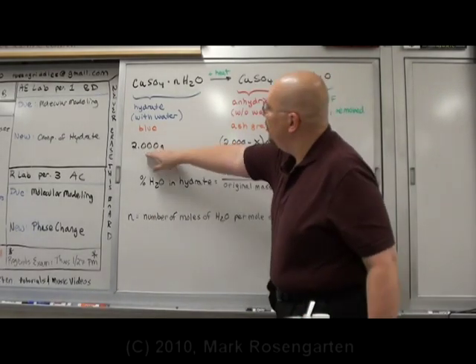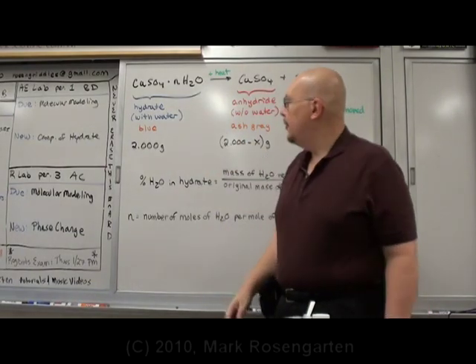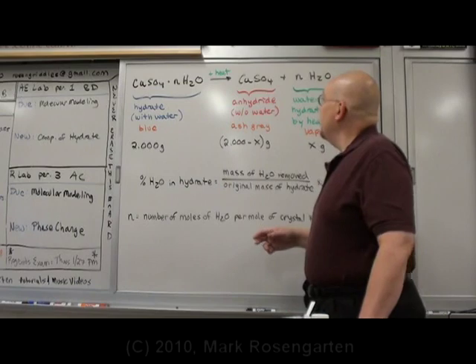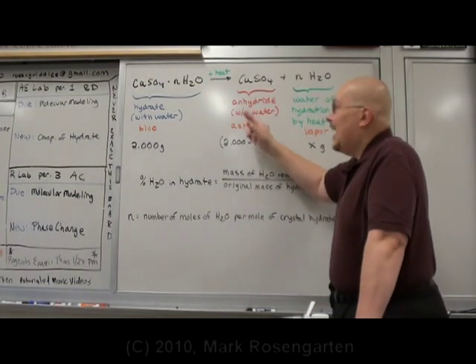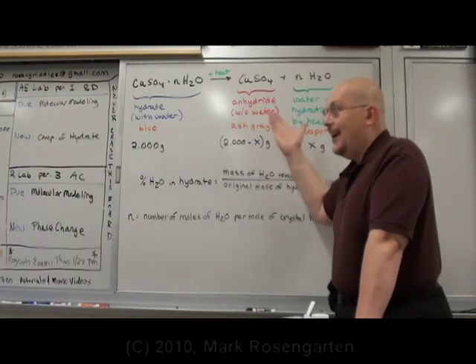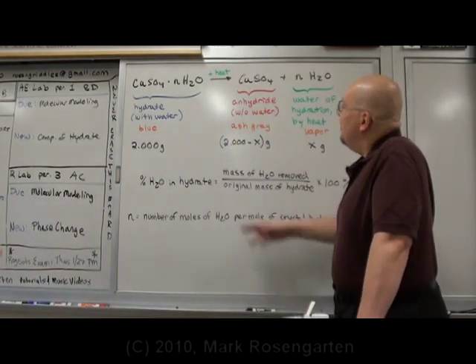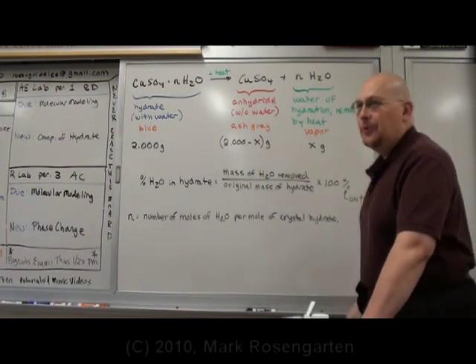We're going to start with 2.000 grams of copper sulfate hydrate. It's going to be blue in color. Now, when we heat it up, we're going to end up with an anhydride — without water. It's going to be ash gray in color, and the mass is going to go down. Why? Because you drove out the water of hydration.